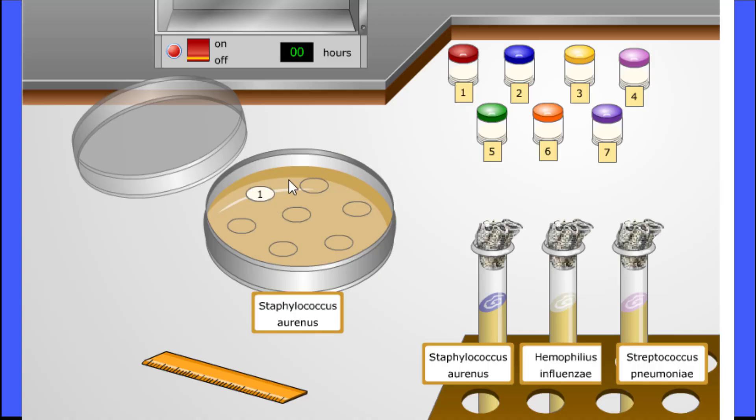Next, we can place our discs. Disc 1 is used as a negative control. It is simply the filter disc placed in water, which should have no antimicrobial effectiveness.